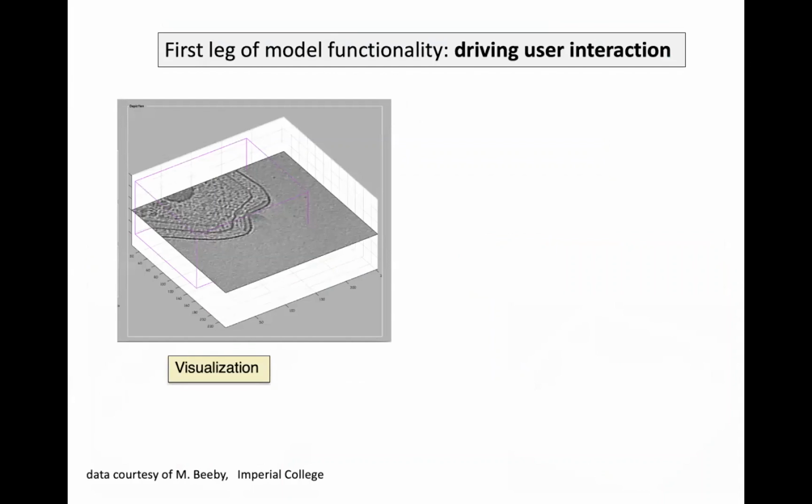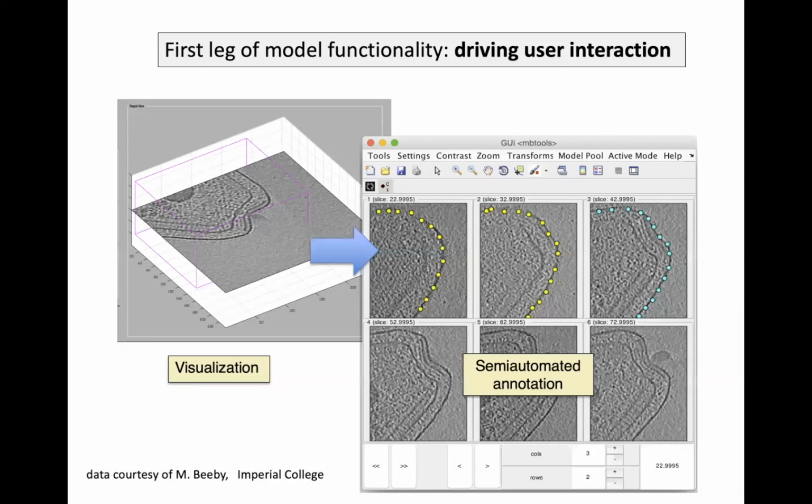For instance, let's imagine that we are working with a particular type of model that is specialized in particles that are covering a surface. So the first functionality of this kind of model would be about visualization. In this particular case, when you initiate the model and you tell the model this is one layer, that will be the yellow points that you see on the screen now.